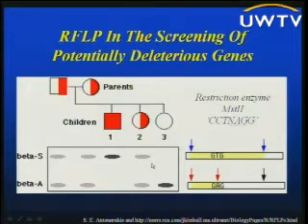And as I said, this was essentially what we used 20 years ago to follow engraftment. Most of it, of course, as you can imagine, was eyeballing the gel to see what percentage we're looking at in terms of donor or recipient.